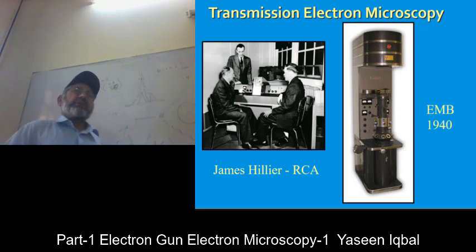Sample preparation, we will have a lecture on that as well, how people prepare samples sequentially, the various steps involved in electron microscope sample preparation. One of my teachers of electron microscopy, in our first lecture in 1993, told us in the class that when you have prepared a sample for a transmission electron microscope, 50% of the job is done.